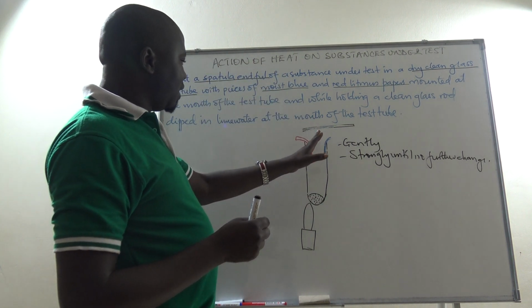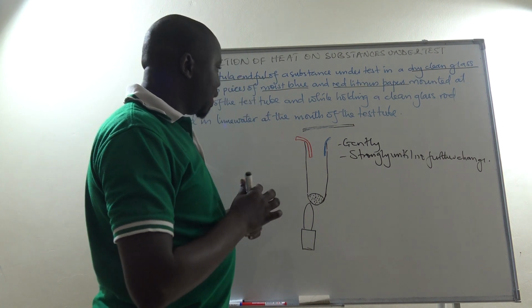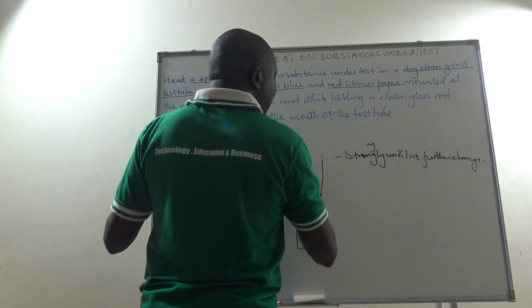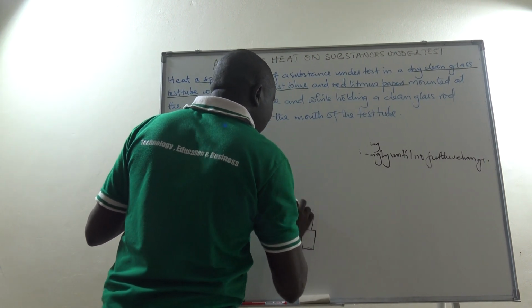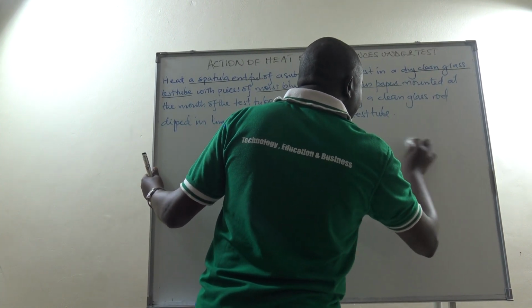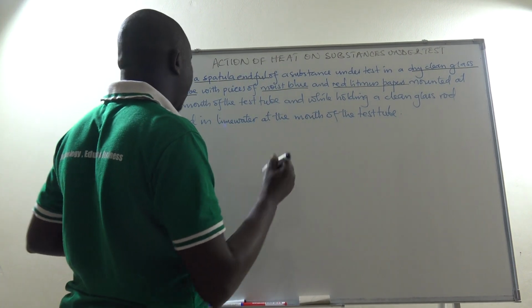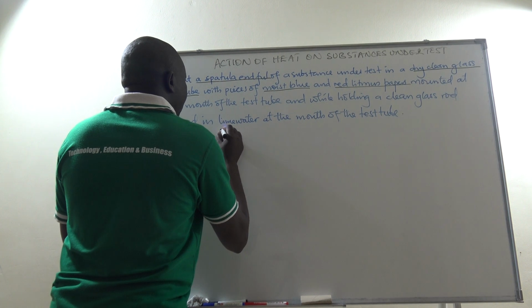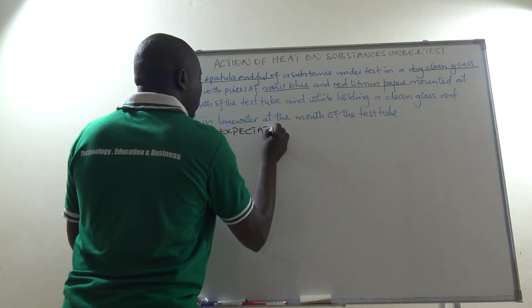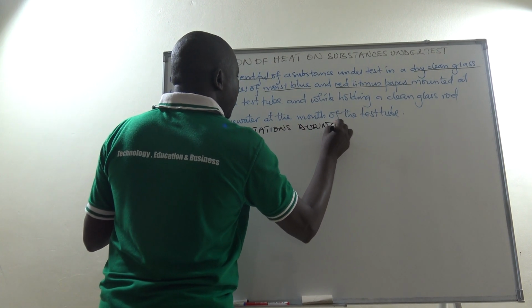So when you are heating, there are things that you should expect. And that's what we are going to look at right now: expectations during heating. We are going to heat the substance gently at first and then later on strongly until no further change. So let us look at expectations during heating.